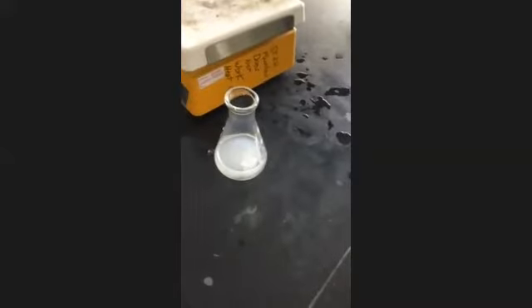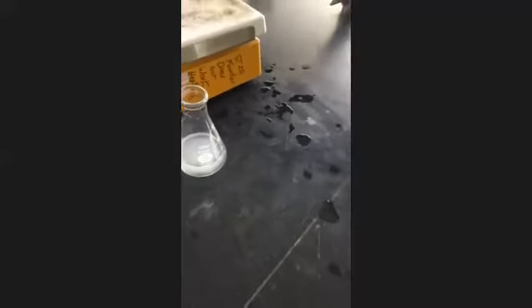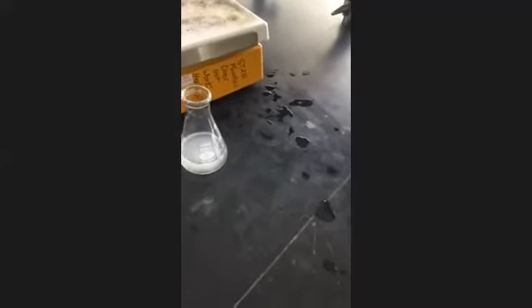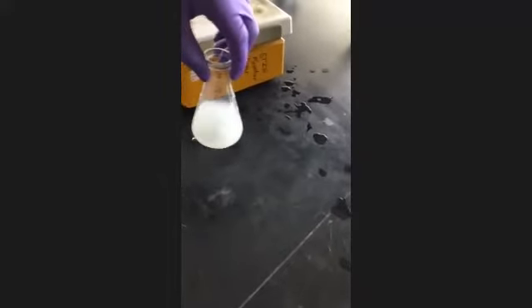And so what the water does, see, aspirin is not soluble in water. So what we're gonna do is force the aspirin out of the solution by adding water and then cooling it down on an ice bath. The colder the solution gets, the more insoluble the aspirin becomes. So we added 40 mils of water, and now we're gonna put that on an ice bath and watch it crystallize.